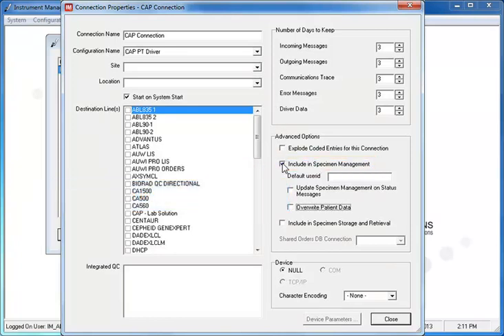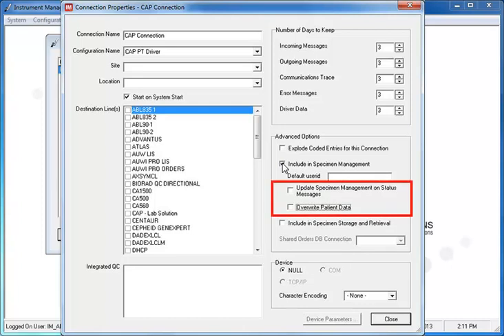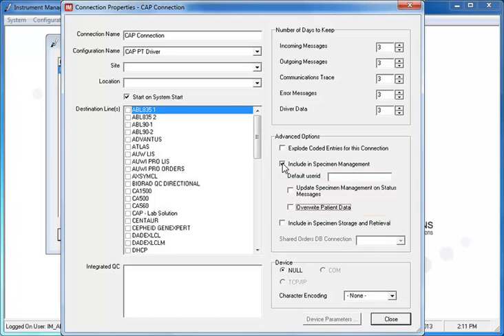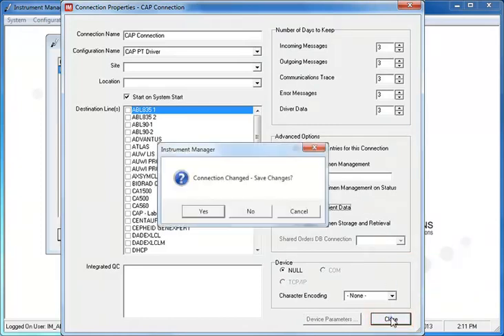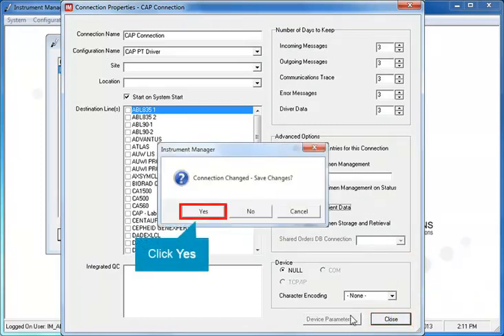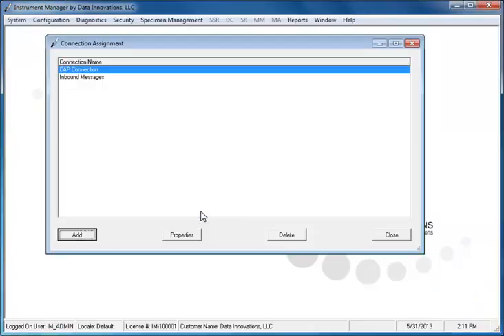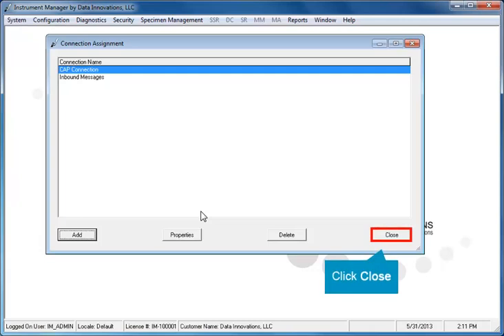If necessary, you could also choose to update Specimen Management on Status Messages, or Overwrite Patient Data. Once you have made your selections in the Connection Properties window, click the Close button. Click Yes to save your changes and close the Connection Assignment window.